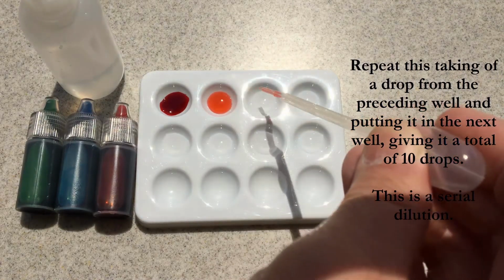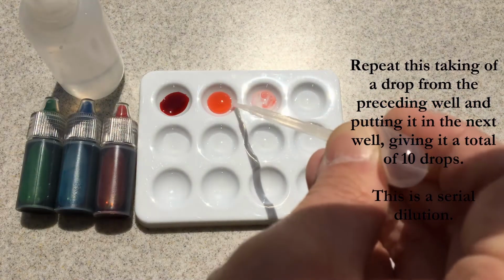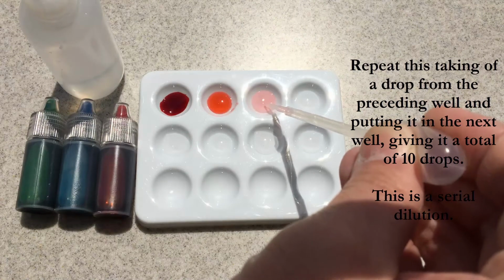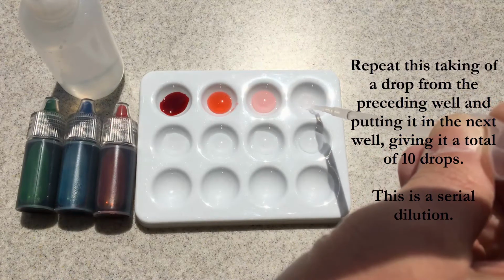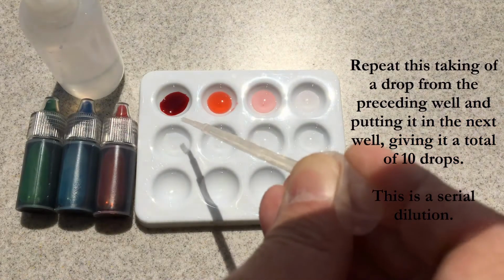Again, any leftover will go back to the preceding well, and we'll move on to the next well, mixing, taking a drop, mixing, taking a drop, mixing, taking a drop. Again, any leftover that goes beyond 1 drop will go back into the original well where it came from.